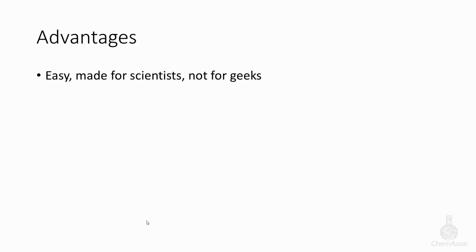Let me summarize the advantages of Plexus Connect. It is easy to use. It is made for scientists and not for geeks. We continuously monitor and validate the web application with the help of chemists, biologists, and other non-technical people to keep it simple in the future as well.